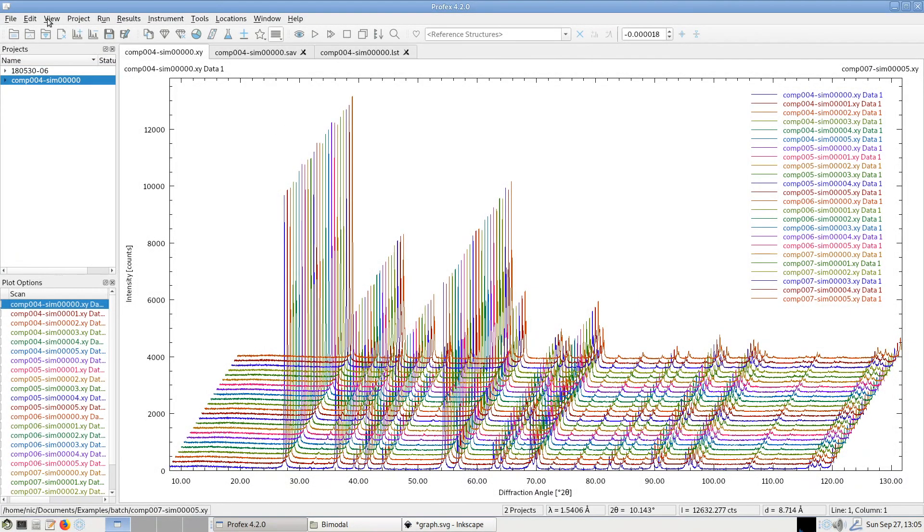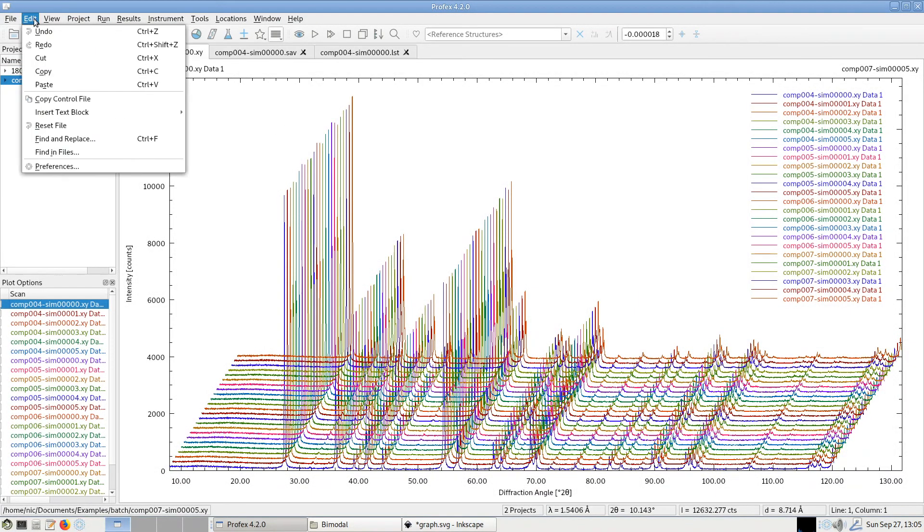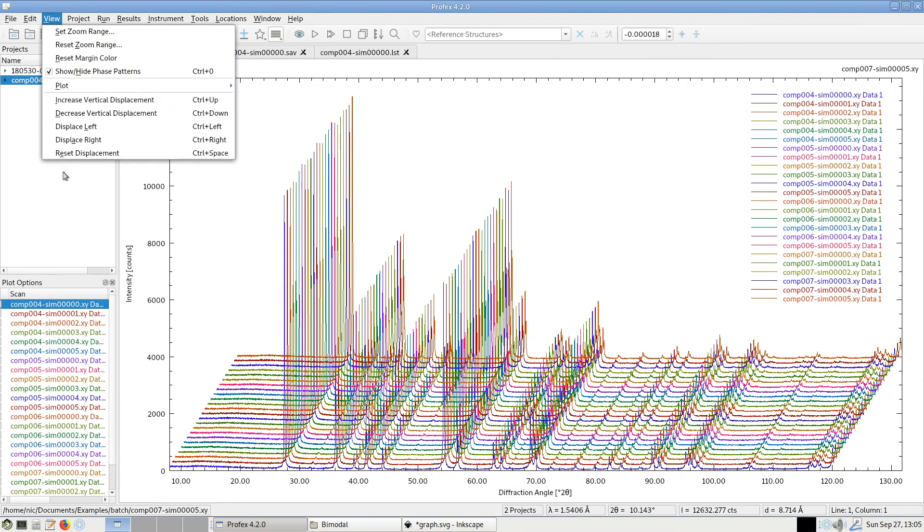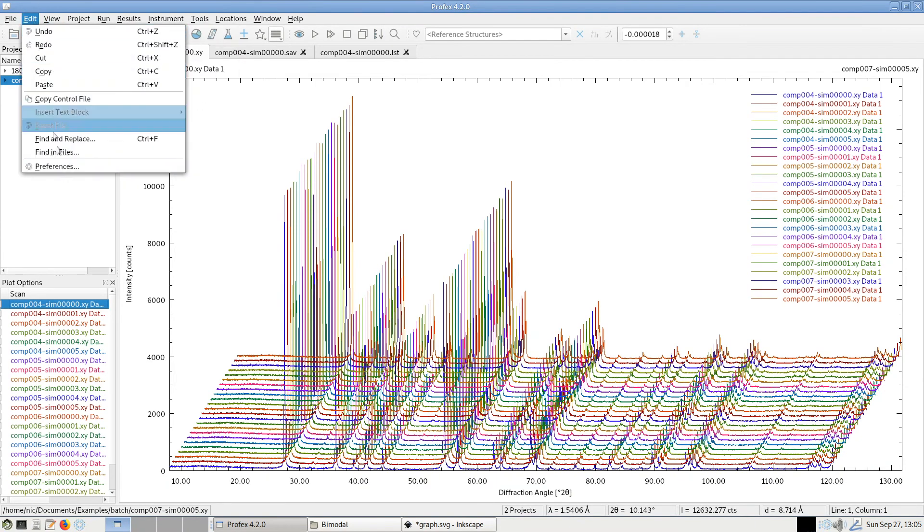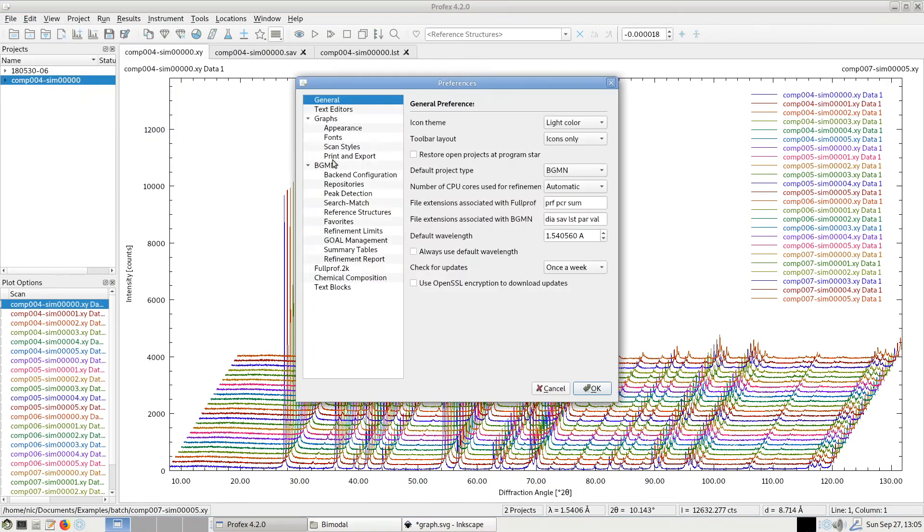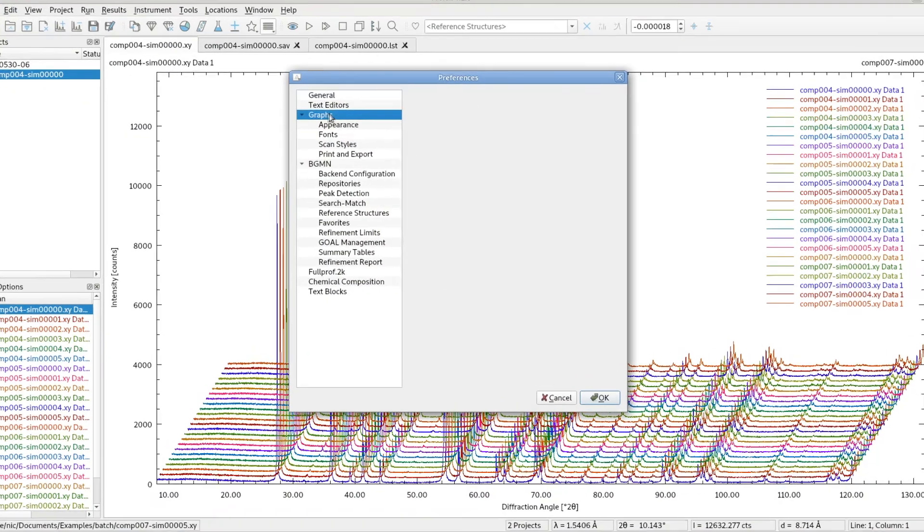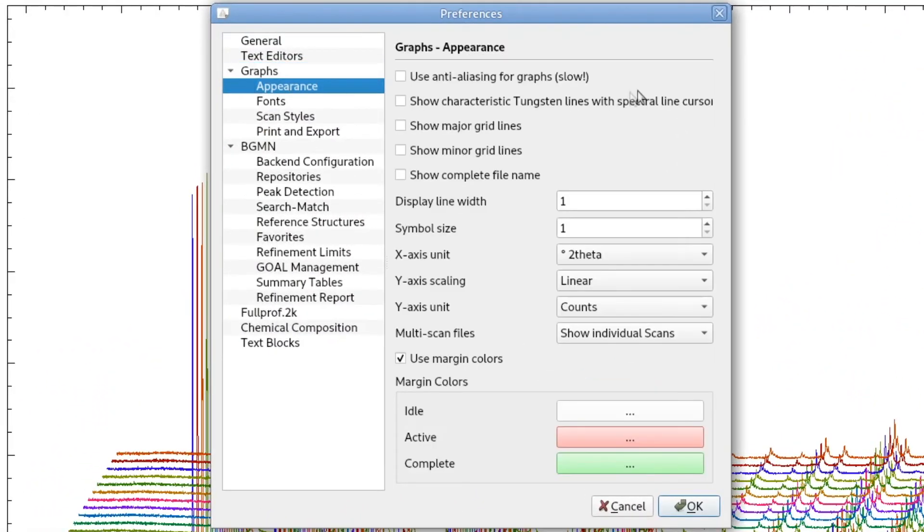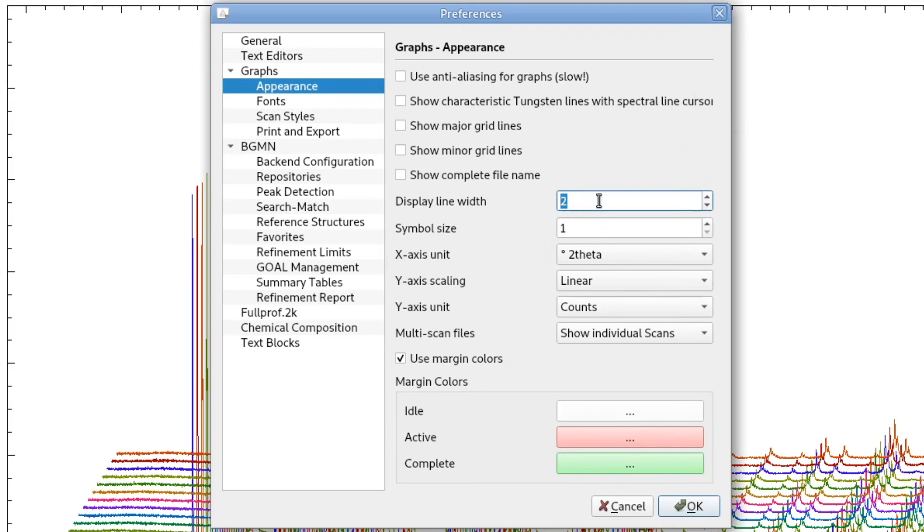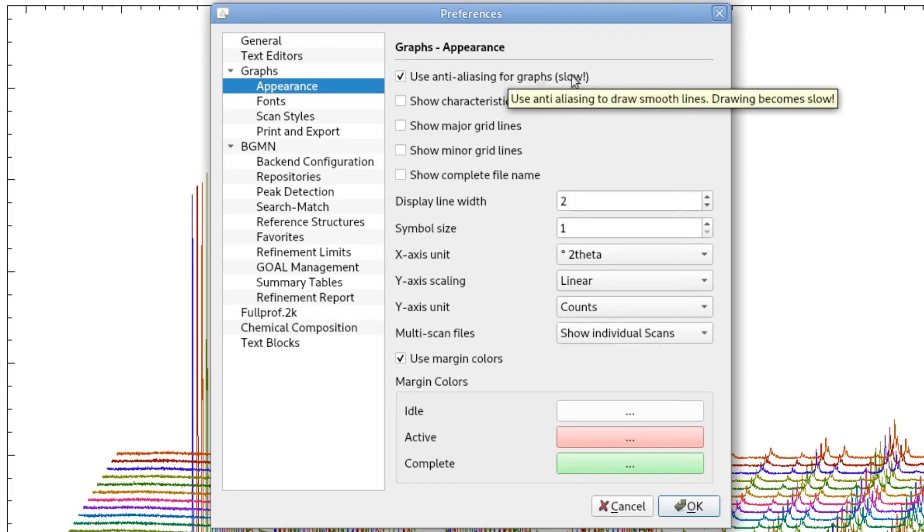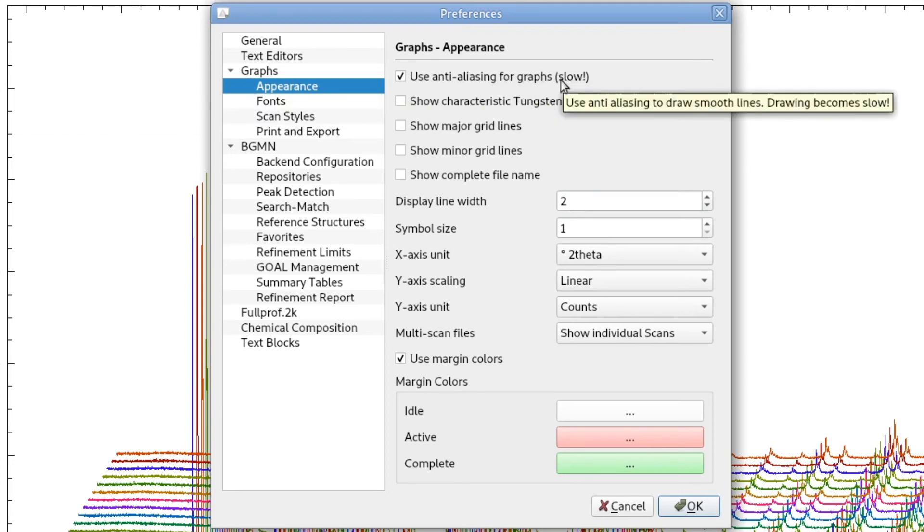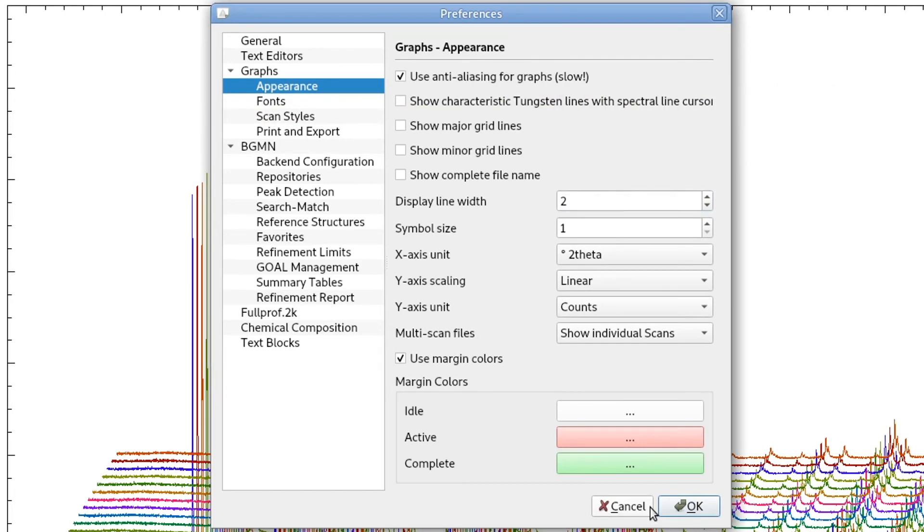Back in Profex, we can also change some of the appearance settings in the preferences. If we go to Edit, Preferences, in the Graph section, Appearance, we can, for example, change the line width. Especially on high resolution displays, retina displays, we might have to use a wider line width. We can use anti-aliasing. But be careful, this is slowing down the drawing quite a bit.